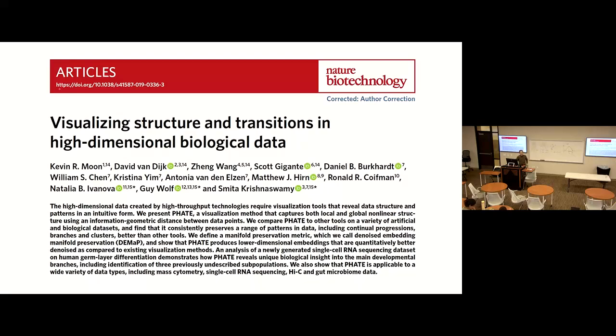dimensionality reduction, to treat the cloud of data points as a complex manifold structure rather than just simply computing the distance. You know, in t-SNE, we just compute the Euclidean distance between cells and then project using distributions. But here, we think you cannot just simply use the Euclidean distance.